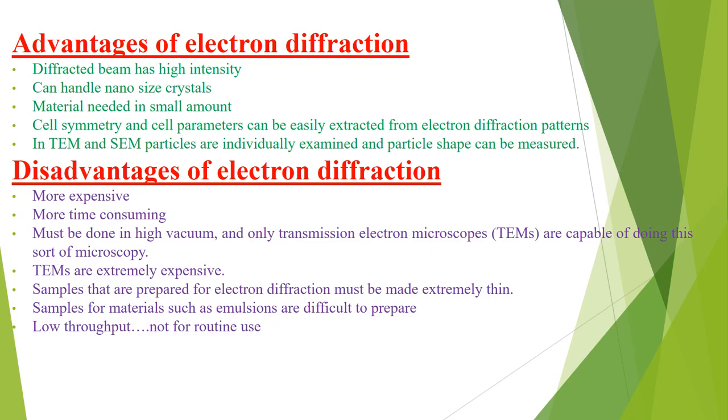In TEM, transmission electron microscopy, and SEM, scanning electron microscopy, the particles are individually examined and particle shape can be measured.